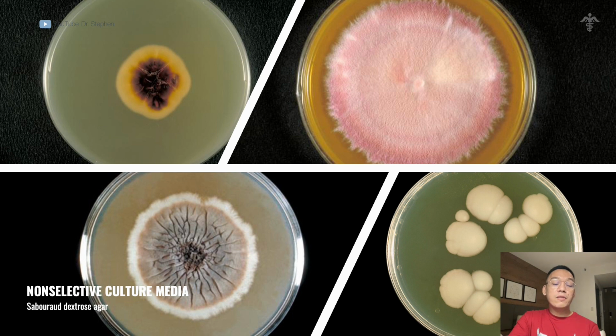Another non-selective culture media is Sabouraud dextrose agar. Sabouraud agar allows us to cultivate dermatophytes and other types of fungi because of the peptones contained in this medium.